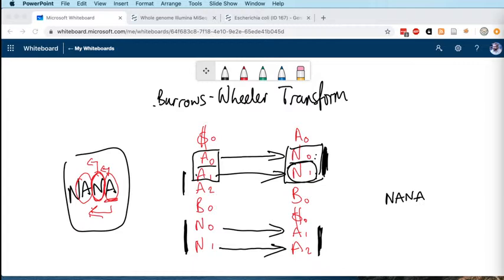There are then tricks, which again I'm not going to go into here, that Ben Langmead talks about in his videos, of then figuring out where in the string that match is. So that's essentially how this data structure is, A, constructed, and then B, used for searching for exact matches of particular strings. And so lots and lots of aligners for high throughput sequence data exploit this transformation and this data structure for making a genome more searchable. It's about the size of your genome, and about the efficiency of searching it.